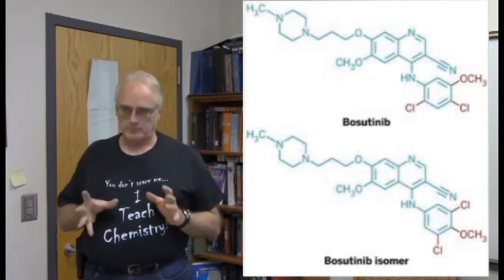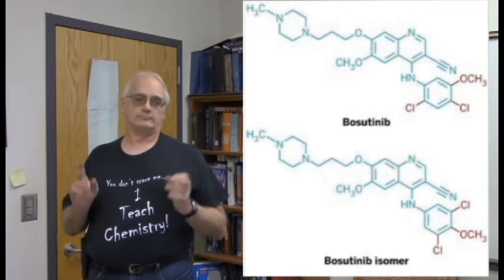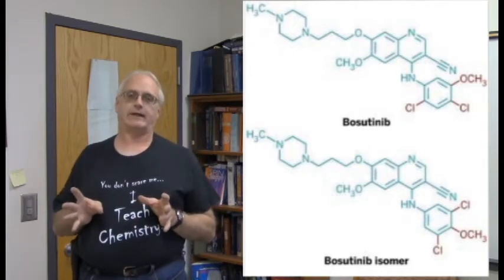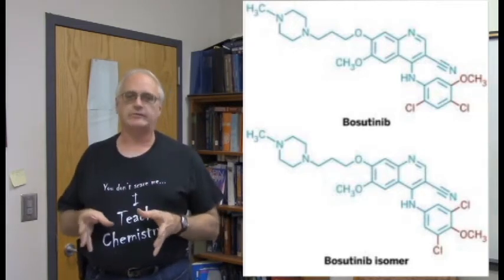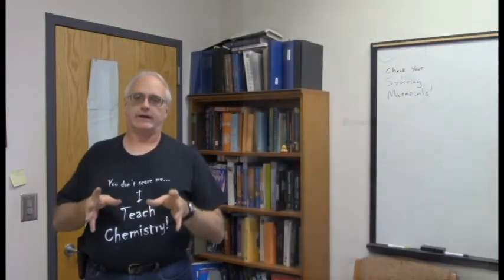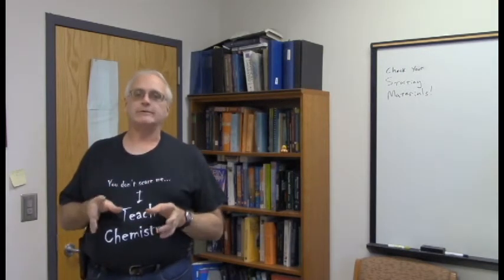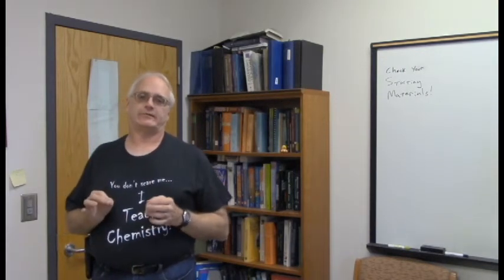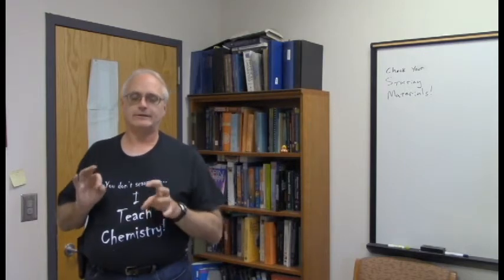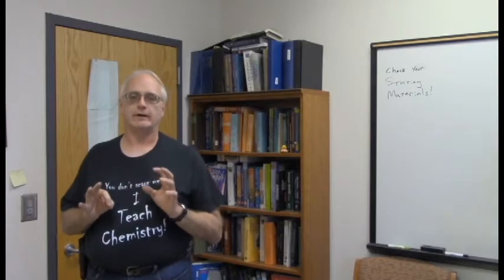Now, this is a big molecule. The NMR spectra are not going to be trivial, but if you're going to do this type of stuff, then I think it's critical that you are absolutely certain of the material that you just bought. And this is, I think, a nice illustration of it. Quoting the paper for a moment, there's a couple of sentences in here that I think are really nicely laid out, and so I want to quote these directly.